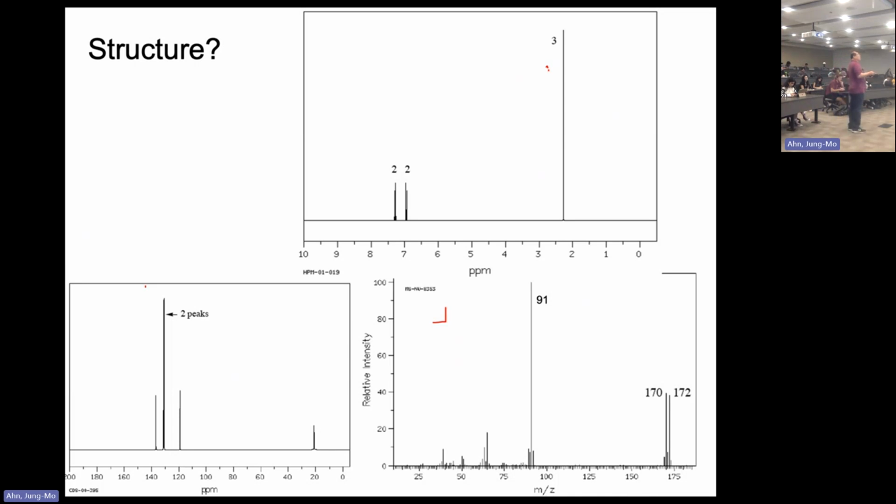So let's start finding out what things we have to pay attention to. Look at the proton NMR: we got peaks between 7 and 8, and two peaks. That region, 7 to 8, is the aromatic region. Typically a structure like benzene will show peaks there. By the way, these two does not mean it's a doublet.